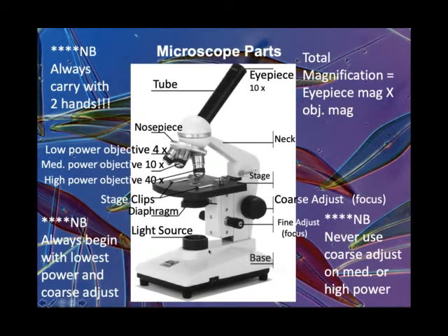The last part of the microscope is the base. Please try to have the base flat on a desk or a countertop. Don't have it sitting half on something and half not. These are expensive, so make sure that you pay attention to where the base is sitting.